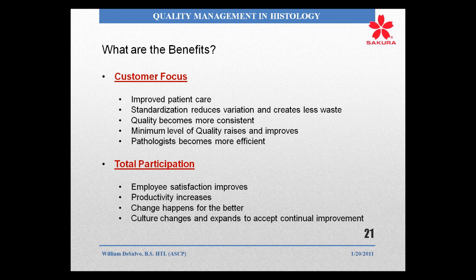And you're going to be thinking to yourself right now, well, we turn out the best slides there are. But there's always room for improvement, and any improvements that you can affect in your laboratory will ultimately improve your patient care. Think of it, if you can reduce one recut, reduce one repeat of a stain, or one incidence where you have to add extra stains because information is inconclusive, if you can help to affect that, you're directly affecting improved patient care. Standardization at any and all your steps will reduce your variation, and that creates less waste.